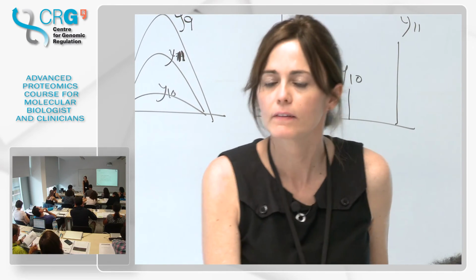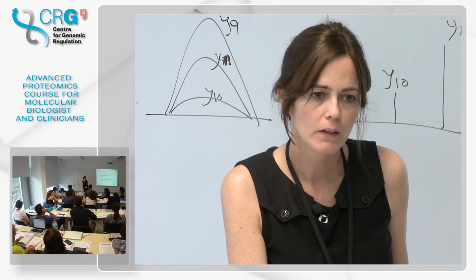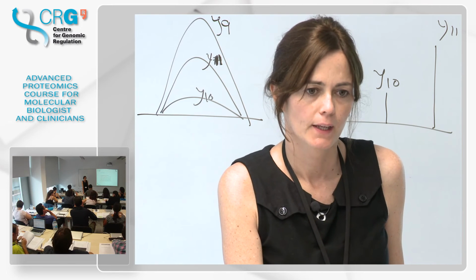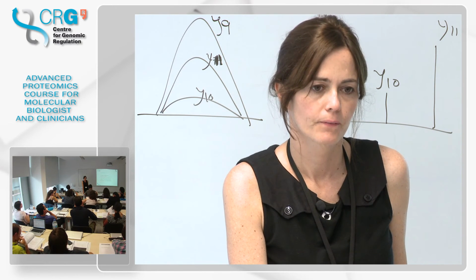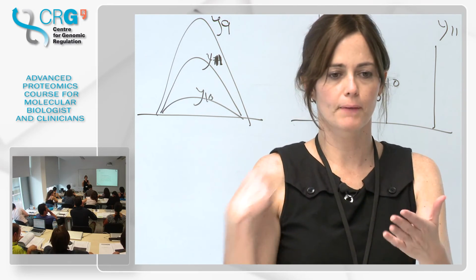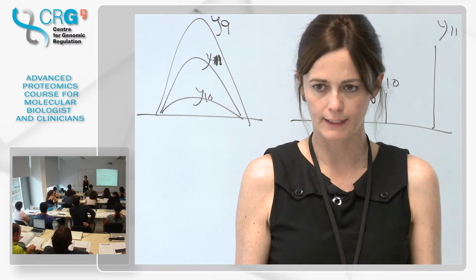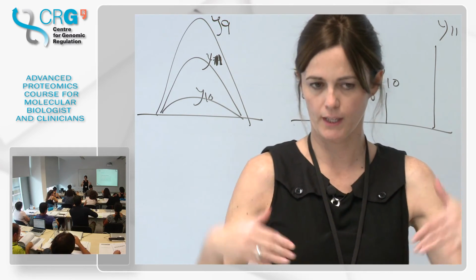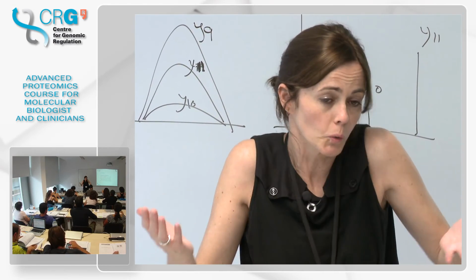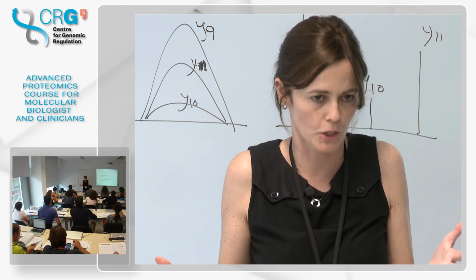For the calibration, how do you do it? Every run, you make your calibration curve with your matrix, and after you spike your samples, so you run your calibration curve and then your samples. Yes, but not every run. You determine what is your linearity range, what is your limit of detection, and then you run your project. Maybe you are running samples for 2 weeks of the same project with the same calibration curve.